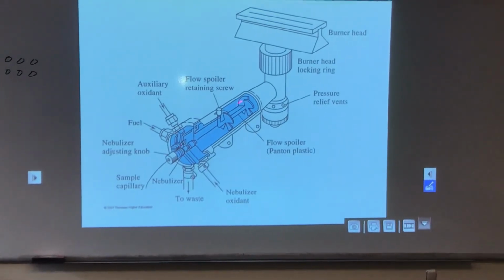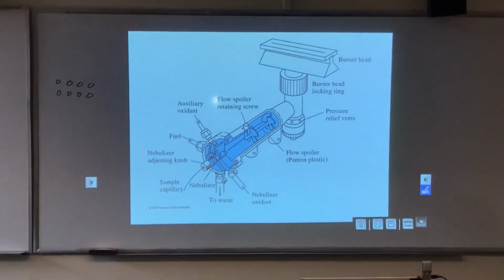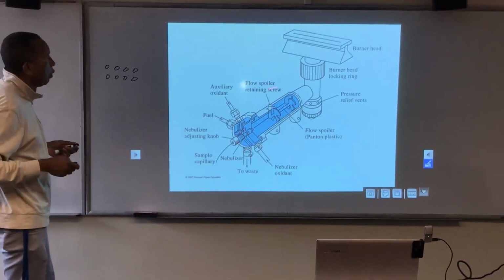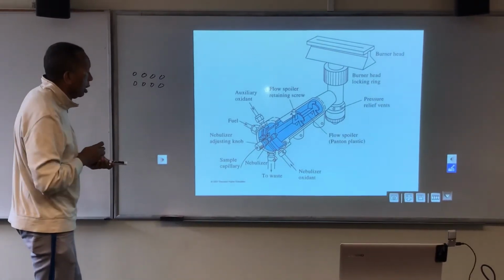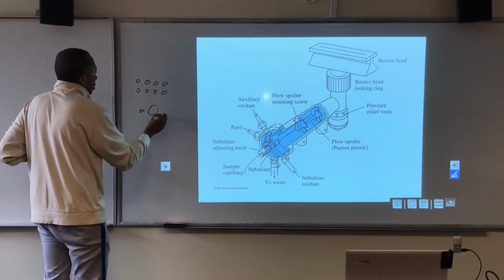The problem with ignoring this part in the middle here is that in the process of nebulization we create particles of different sizes.